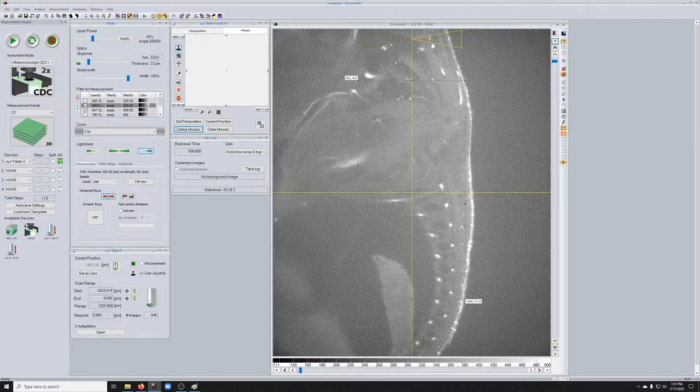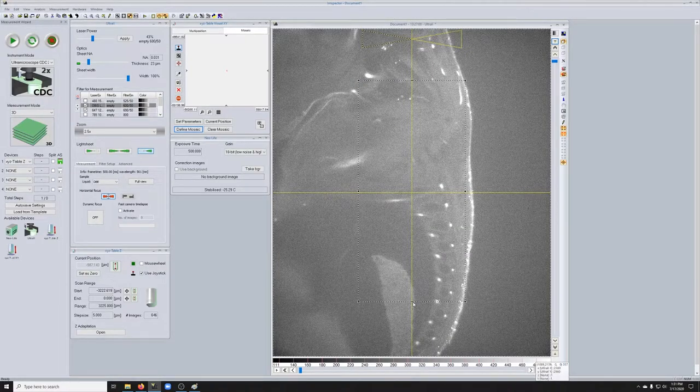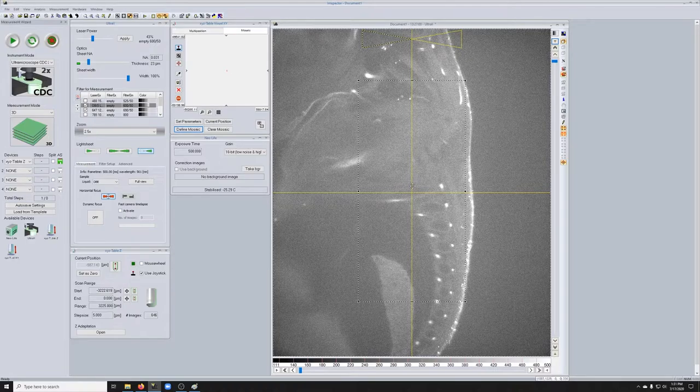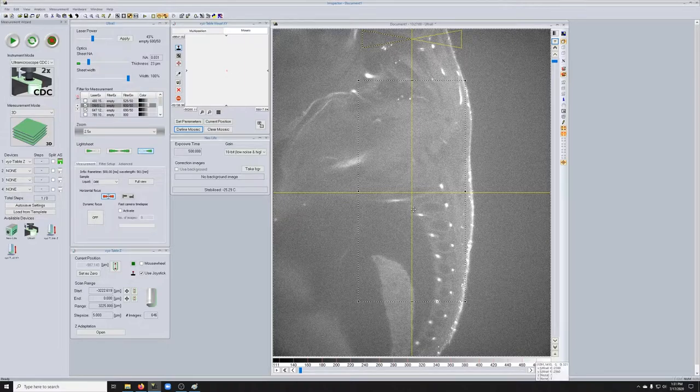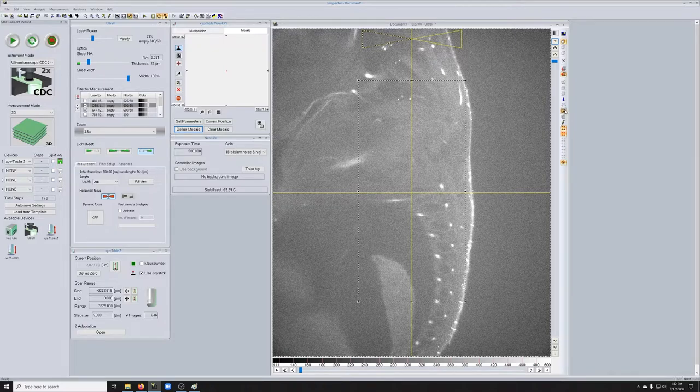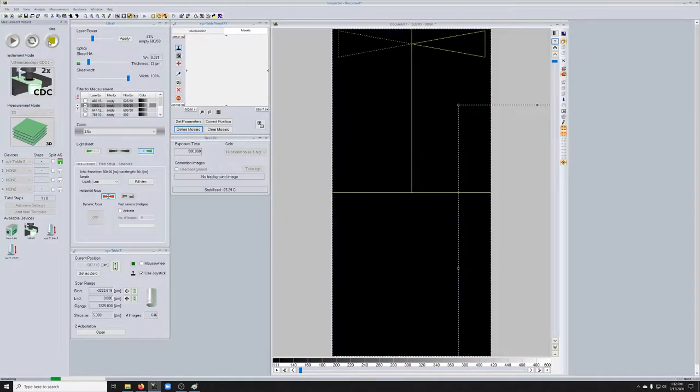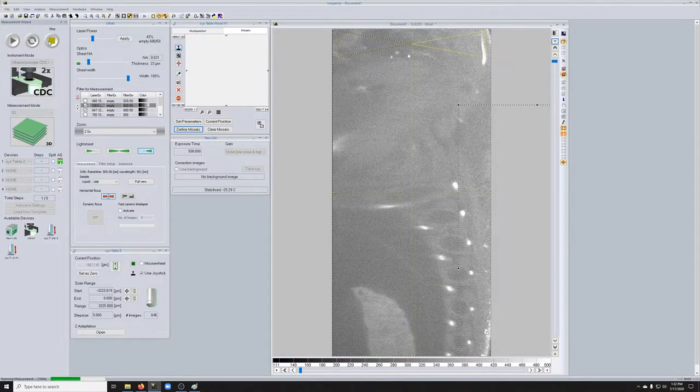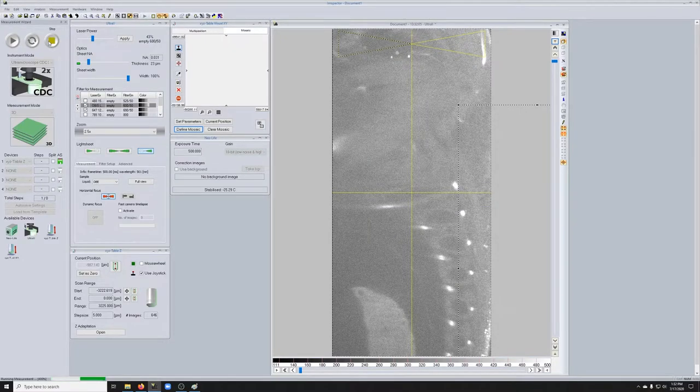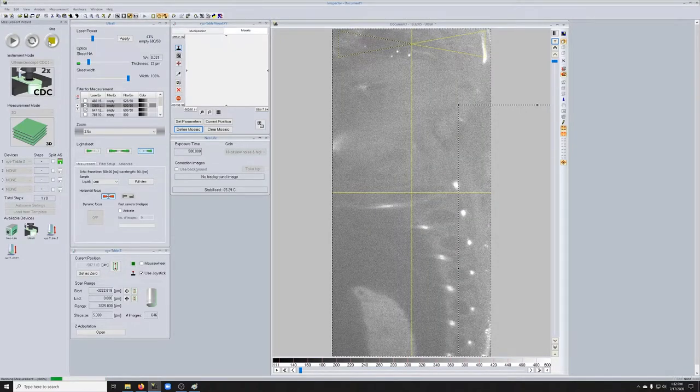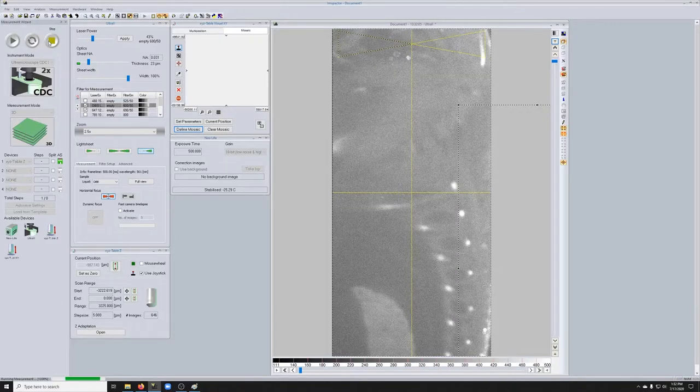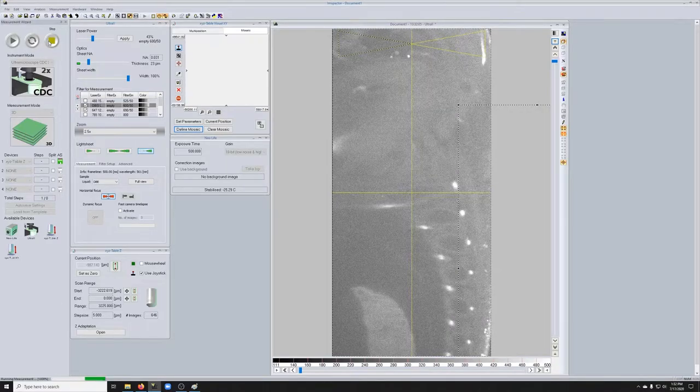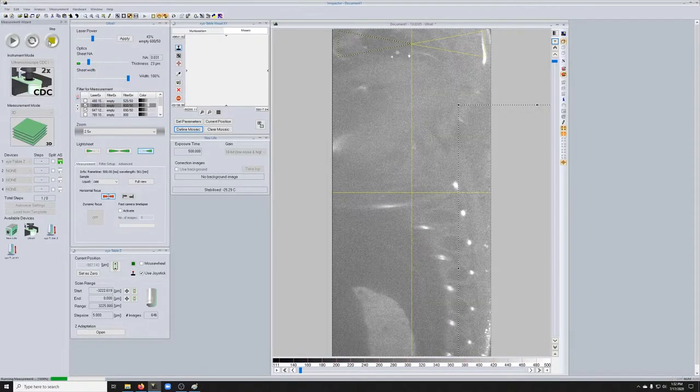But how much again is a matter for testing as you have to do different options, and then stitch them and see how things look around the edges. But let's say this is a good option. So now we need to crop it. So I'll go here, click that button as I showed you before. And if I go to video, I should only see that region, which in fact is what I'm seeing here. So I want to make sure I'm nicely in focus.